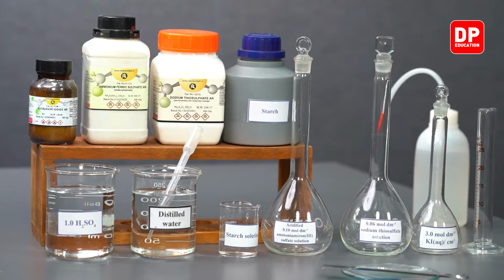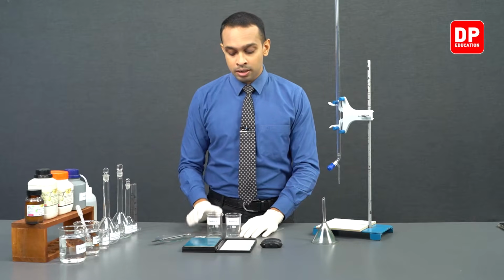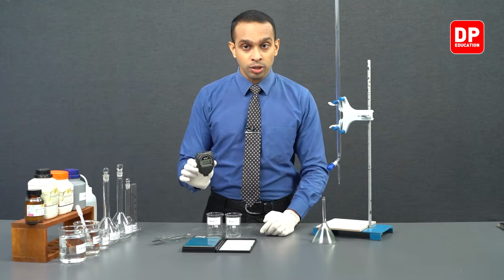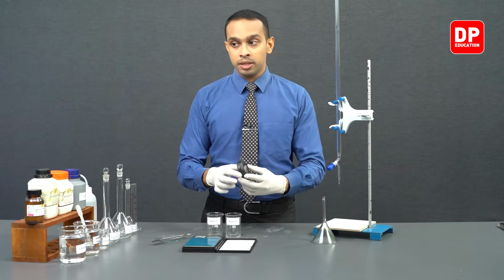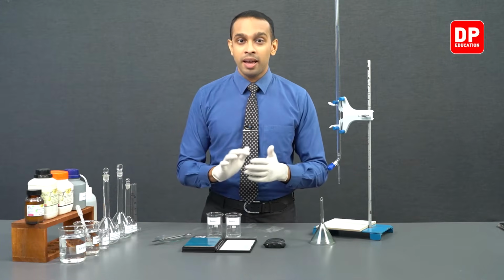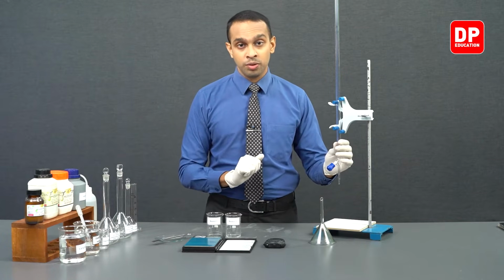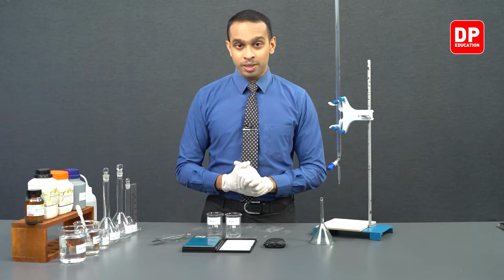And we'll be using beakers. As you can see, the beakers are labeled. We'll be using a stopwatch, a funnel, and burettes to measure the correct volumes of each of the solutions we need.